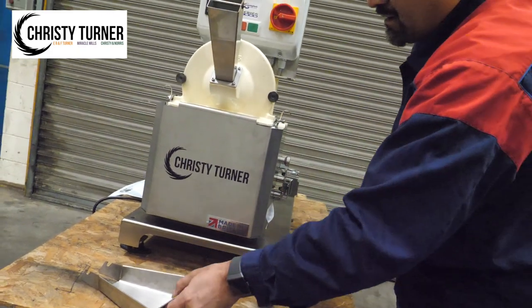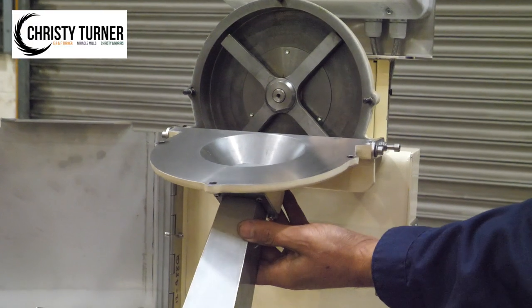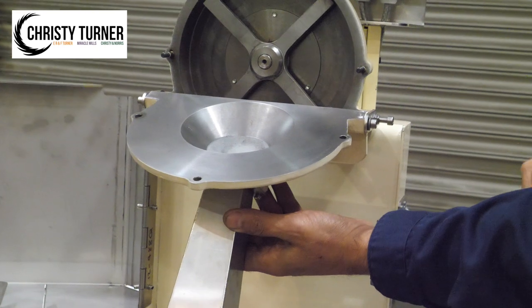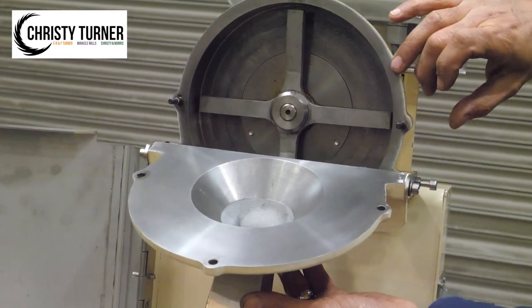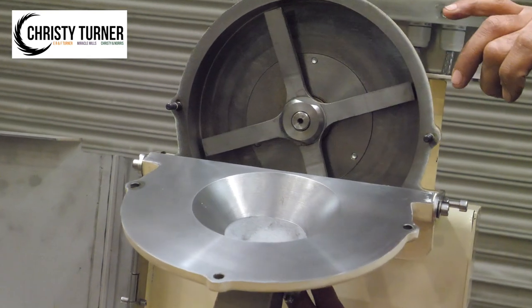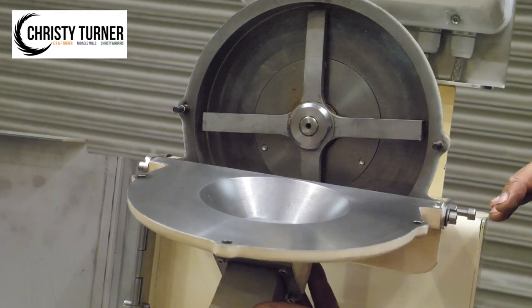The material for testing is fed into the feed tray and travels along a 40x40mm feed chute to meet with the four-arm revolving Betacross. Manufactured from high-grade, heat-treated steel alloy, the Betacross shatters or tears the test material. When the leading edges become worn, the Betacross can simply be reverse-mounted to double its life.